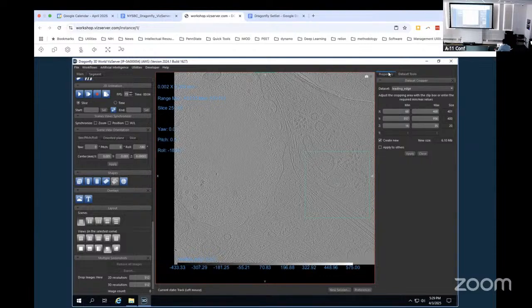You don't even need it. I actually have a cropped version saved. You can literally open it. I just want to teach you how to crop. Okay, got it. Somehow my tomogram is upside down. That's okay. Actually, that's more the right way. That's how my computer runs. But you can right click on it if you want it to be the same as ours. You go to flip rotate.